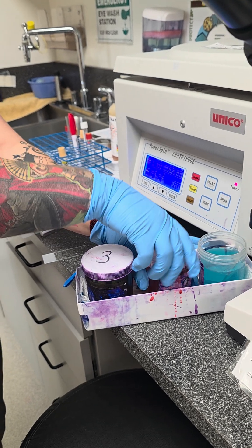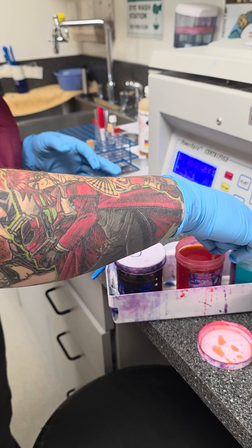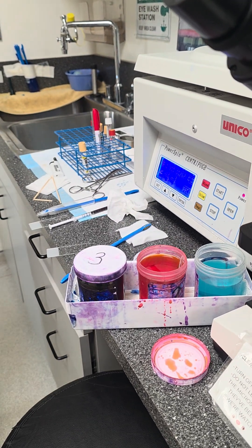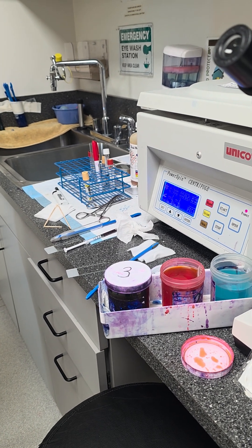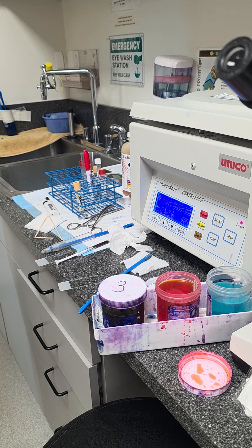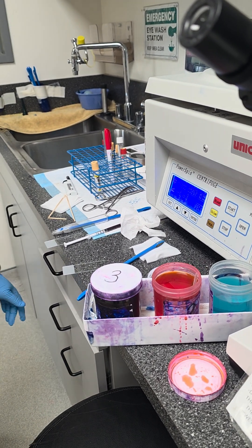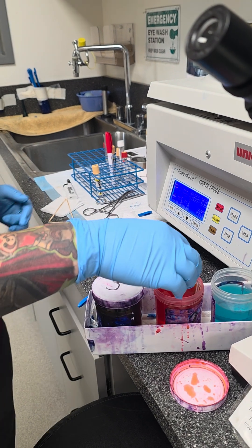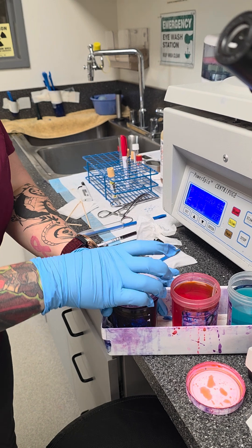And then we're going to go to the next one. I like a dark stain, so I'm going in for 40. Counting 1 through 40.